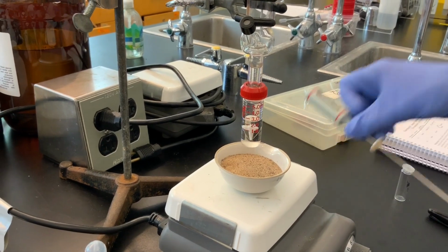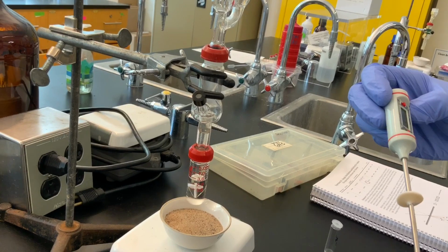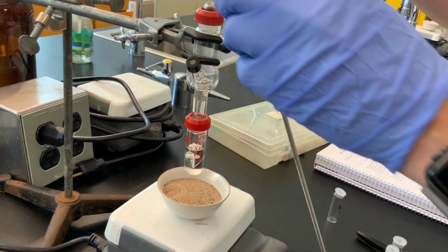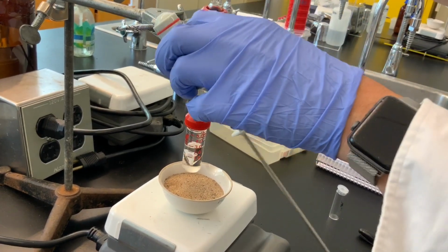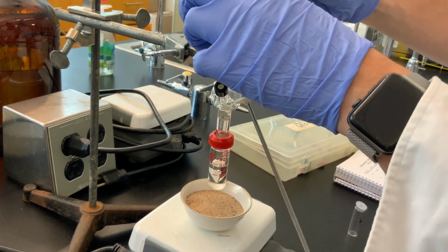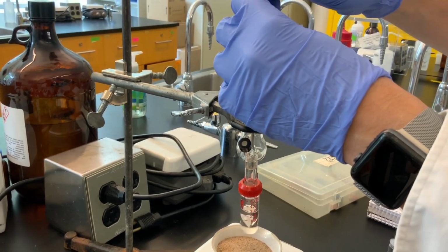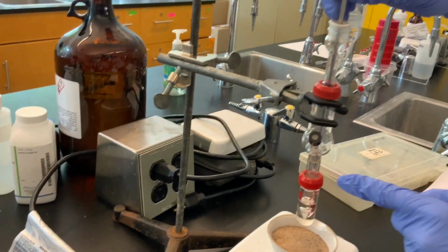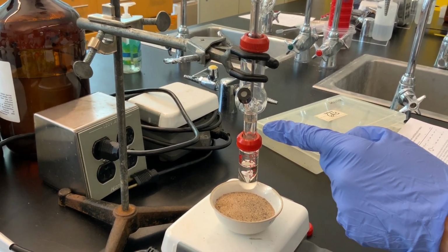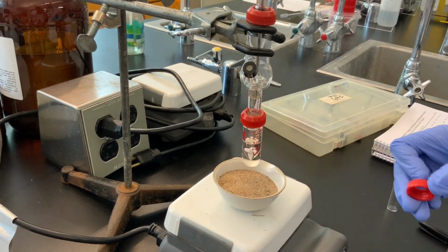So now I'm going to use my digital thermometer. It's important to note perhaps that it's 22.1 degrees Celsius in here today, so it's not the nicest temperature to work in, but I'm now going to replace that with my digital thermometer, and I want the probe to be in the throat here to get an accurate reading of the temperature of the distillate that we're collecting, right?